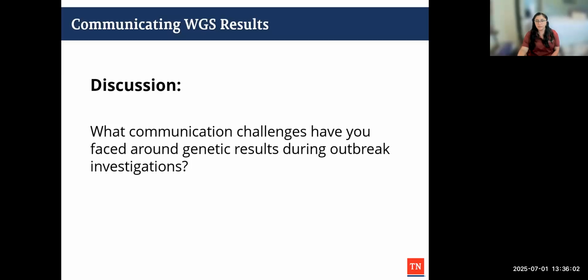So, really making sure that we are consistently prepared to communicate these results to people who don't work with them as frequently, even if they know what WGS is and how we use it, generally speaking. Some of our regular outbreak partners are familiar enough, but they may not see this stuff all the time. So even with somebody who knows a little bit, make sure you are still taking the time to explain yourself clearly when interpreting the results.